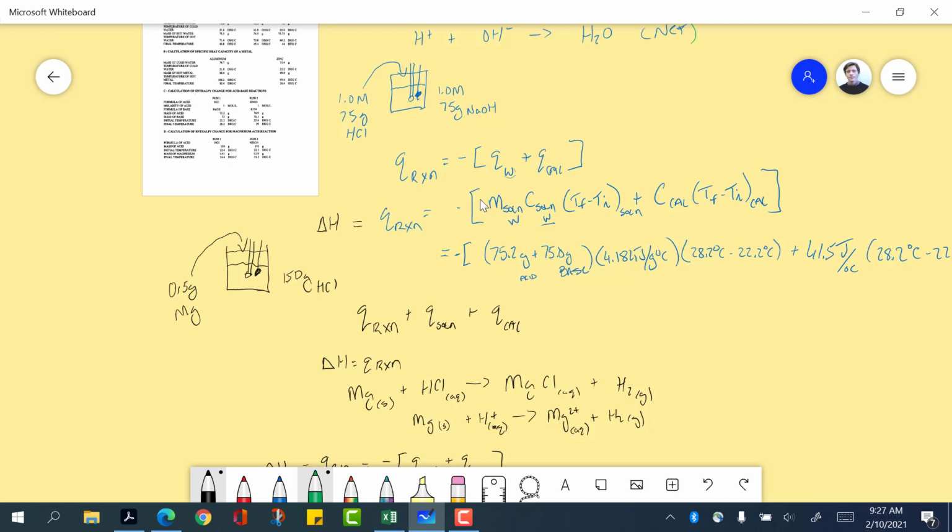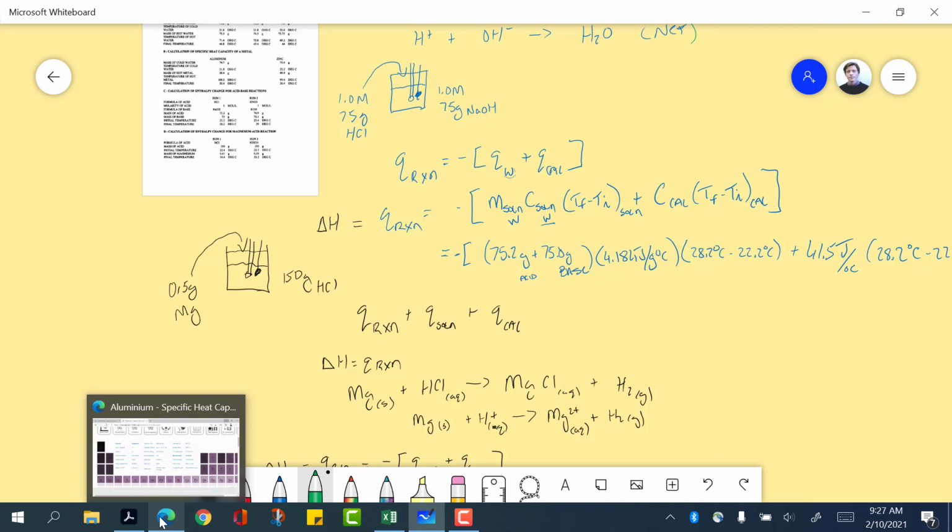So in this particular lab, there's actually a simulation in McGraw-Hill Connect, and you'll actually carry out that simulation, and it should be close to what we're doing right here. This is actually the lab that you would have done in class, and knowing how to do these calorimetry calculations, that's what you'll need to know for the lab practical.